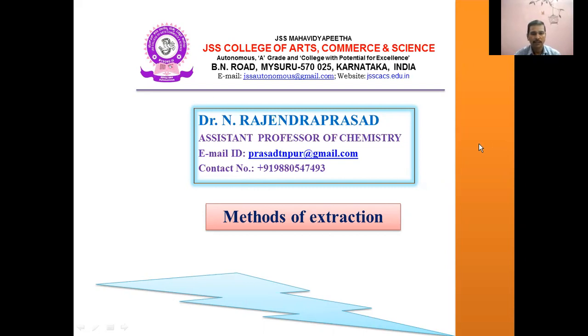Methods of extraction are very important in order to understand which liquid-liquid extraction method has to be followed for the extraction of the solutes which are present in various quantities. Suppose you take a sample in which the analyte is present in very minute quantity. What is the extraction technique we have to use? And if the sample contains the analyte in more quantity, say at the milligram level, say 10 milligram, 50 milligram, 100 milligram, or even 500 milligram, what is the extraction technique we have to use?